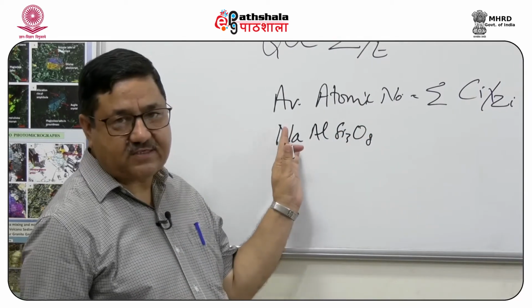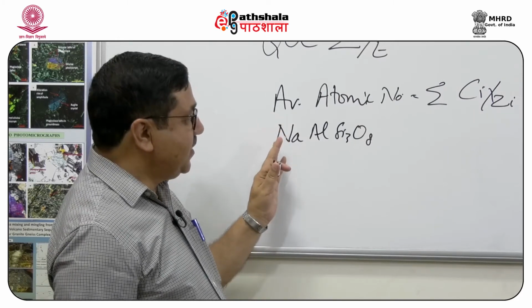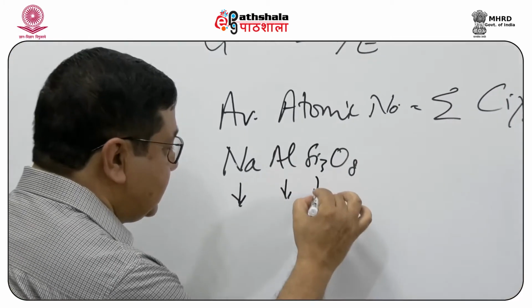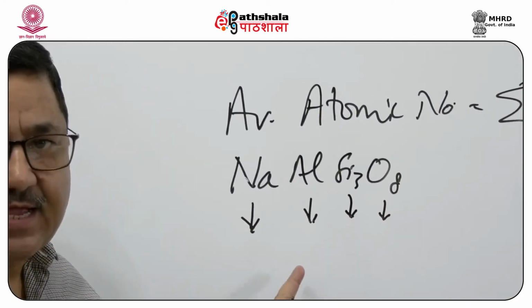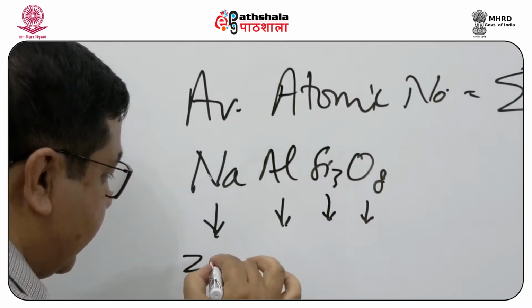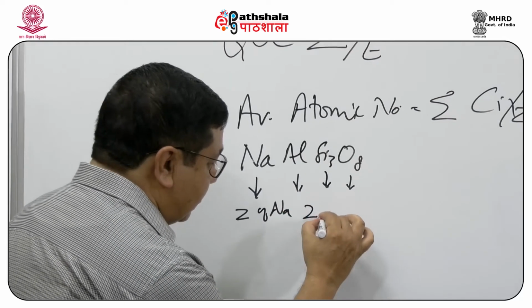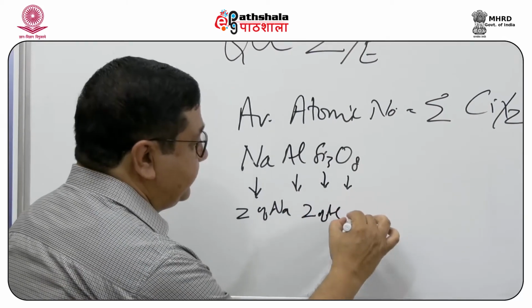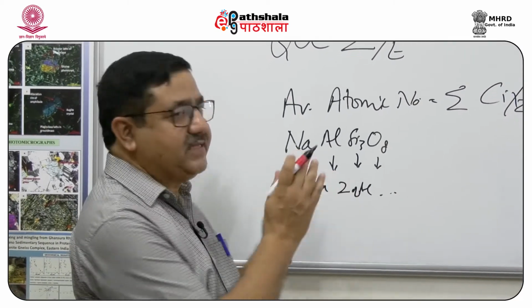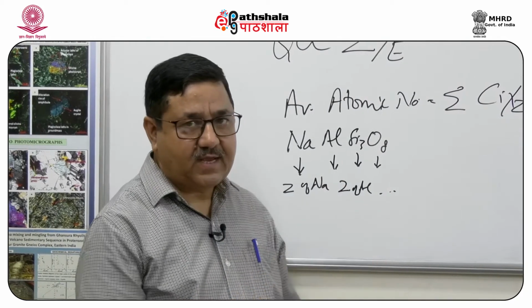of Plagioclase-Feldspar known as Albite. Now, in this, if we have the concentration of sodium, aluminum, silicon and oxygen, and that fraction of concentration is multiplied by their atomic number, that is Z of Na, Z of Al, etc., and we sum that up, that will represent the average atomic number of Albite.